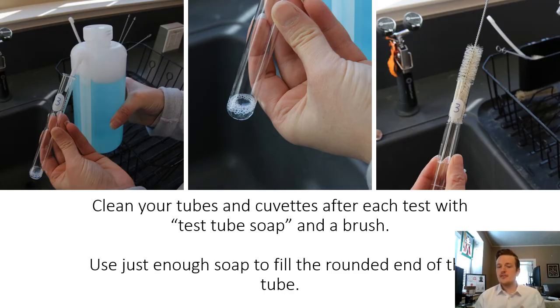So as I mentioned last week, or 2 weeks ago, I guess, you need to very thoroughly clean your tubes and cuvettes after each test. In this case, it's more important. Well, it's the same amount of important, but if you don't clean your tubes in between your own experiments, there could be carryover enzyme or carryover catechol, and it might be different between the tubes. So you need to make sure that you're cleaning everything out very effectively while you're doing this.